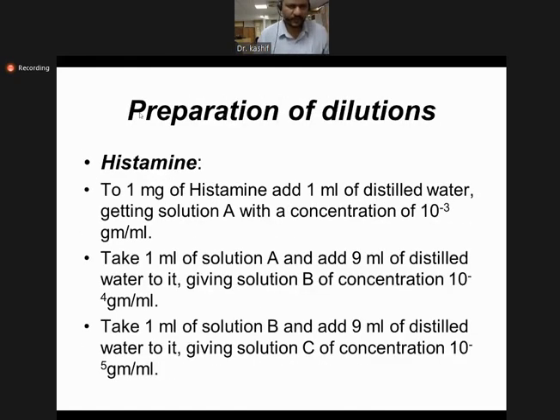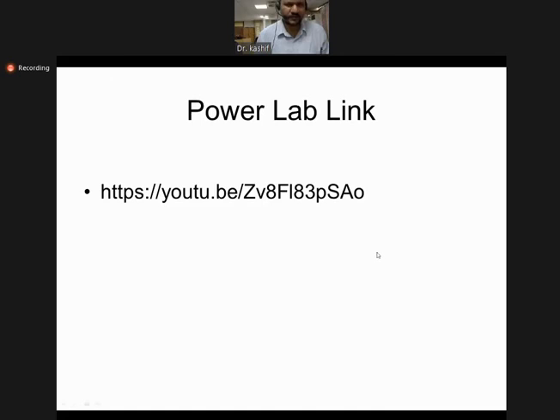Okay, so one of the requests is to please provide the link. So I'll show you the link again. This link you can see, and you can go down and see the Power Lab system. This video contains the different accessories of this Power Lab system. This will be helpful. Otherwise, if people were here, we could show you in the laboratory, because we have this Power Lab system available.